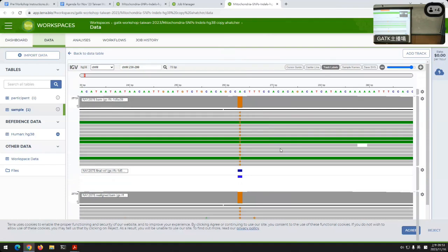So, in summary, what's good about mitochondrial calling? Like I said, you actually have good confidence in things when it comes out of this. That massive depth is good. When you see something there, you're pretty sure. You have to figure out the NUMTs, okay, they complicate things, and you have to do the alignment, but the pipeline does that for you.